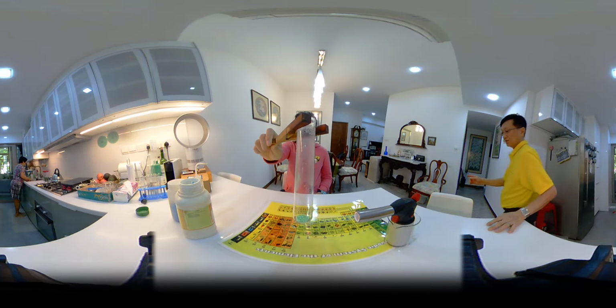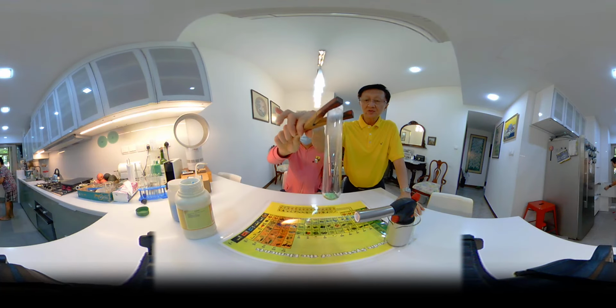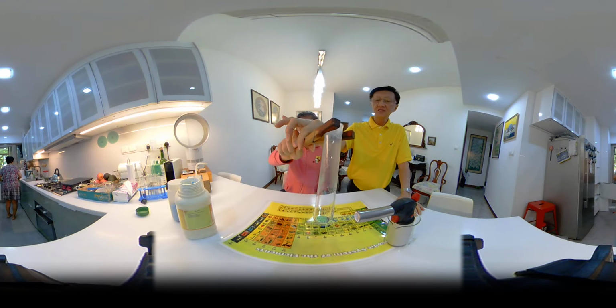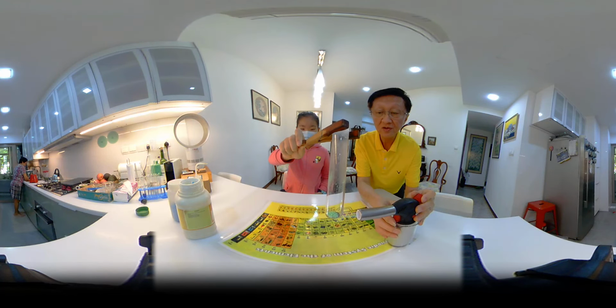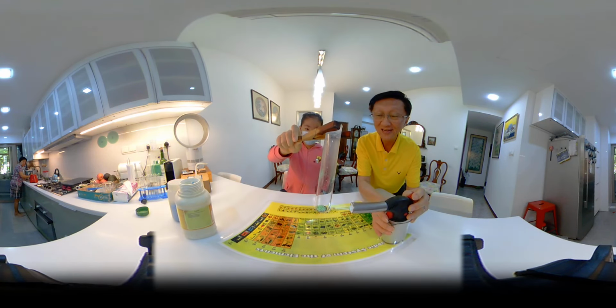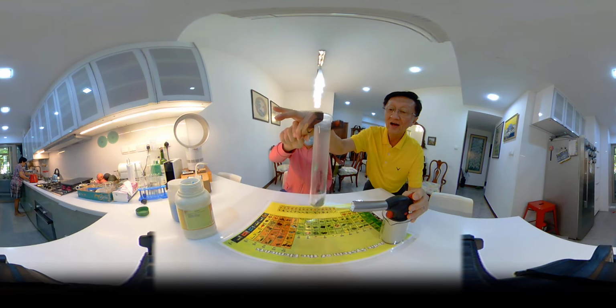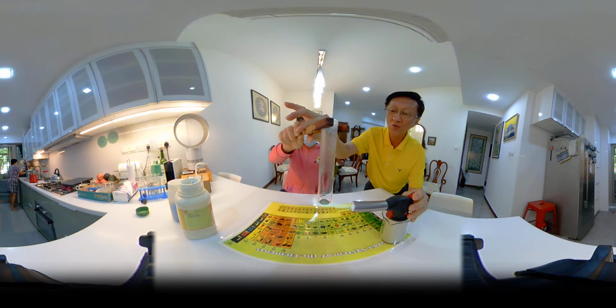Try to put it this way. This heater is not very strong. Okay. What color does it turn into? Dark green? No.